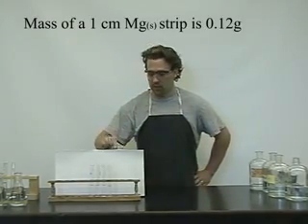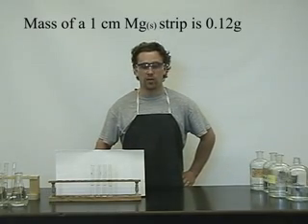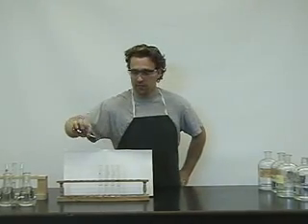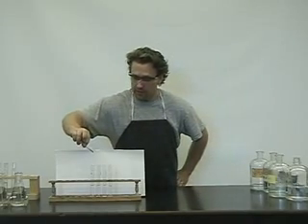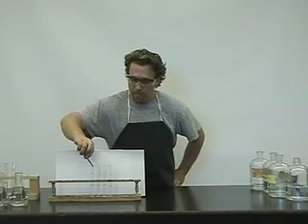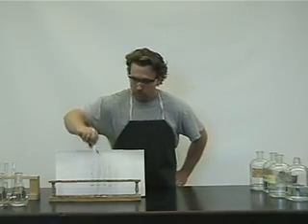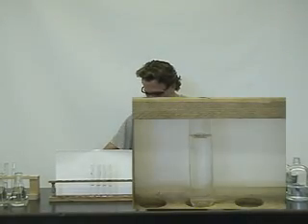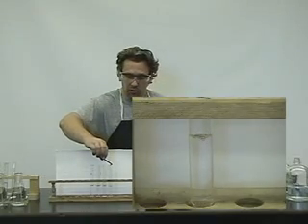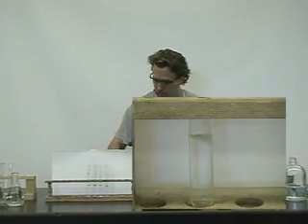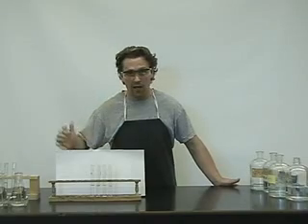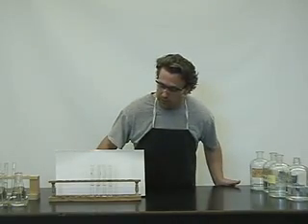Each piece of magnesium metal has a mass of 0.12 grams. We will start off by placing them into the respective test tubes and watching the reaction rate. You'll notice immediately there is an exothermic reaction producing a gas. When magnesium reacts with hydrochloric acid, hydrogen gas is produced. We will place that aside and come back to it in a moment.